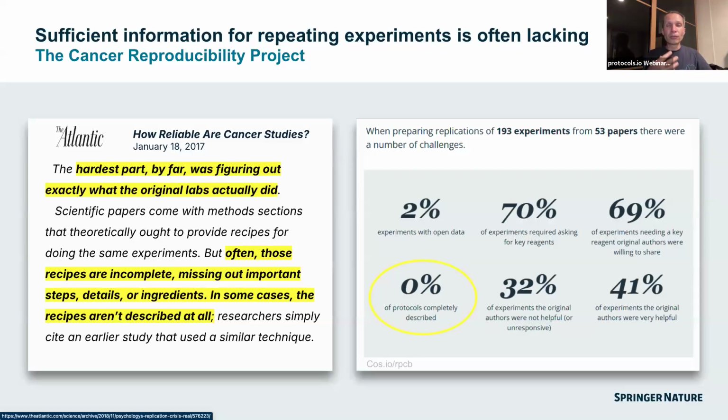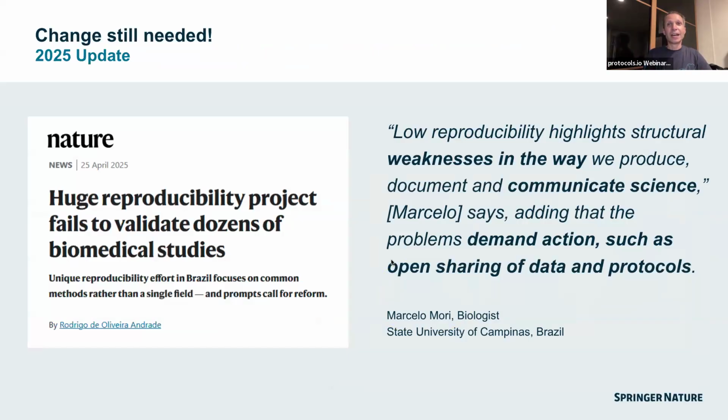So long before we're publishing, we actually have a hard time, even with all of our lab notebooks and electronic lab notebooks, precisely detailing internally in our teams what are the protocols we're all using in the lab, which protocol was used to generate which result, and then when we publish, we're often not doing a great job of giving all of the details and protocols that someone else in our team or outside would need to repeat the experiments.